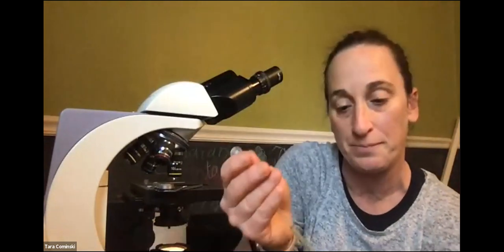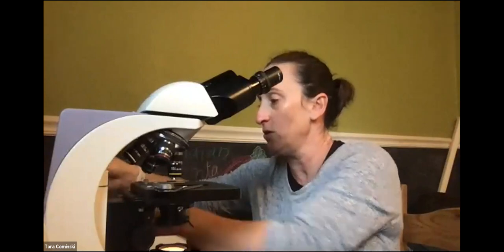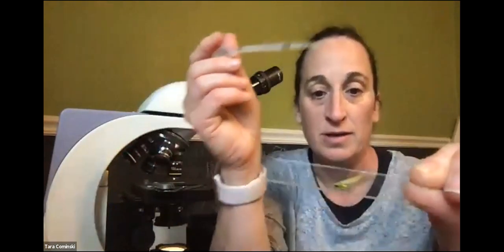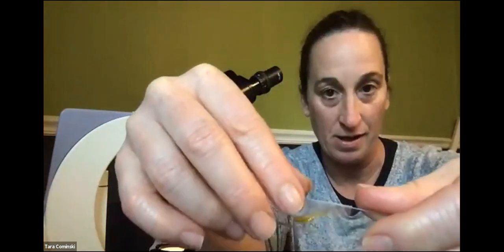Anyway, you put a drop of whatever stain you're going to use, right? So what I did was I took a drop using my transfer pipette that I showed you guys before, and I put a drop on that onion, okay, piece of onion. And then I'm going to put a cover slip on top, okay? So this is kind of like the more fun part of the lab. All right, so now I have a little piece of glass. Sometimes they're plastic. You probably can't see it. And I'm going to place it on top of my onion.